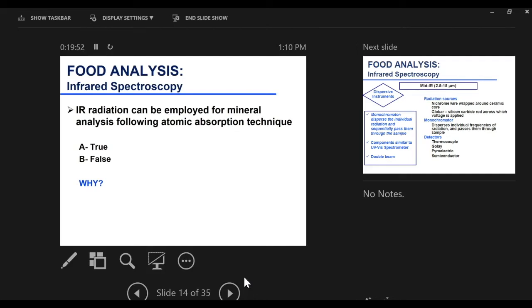For the conversion to remove the organics and the bonds that are organic between carbon. Well, not necessarily carbon and hydrogen. You can do inorganics too with IR. The point here is that with atomic absorption, you are measuring absorption in the atomic state, the gaseous atomic state.